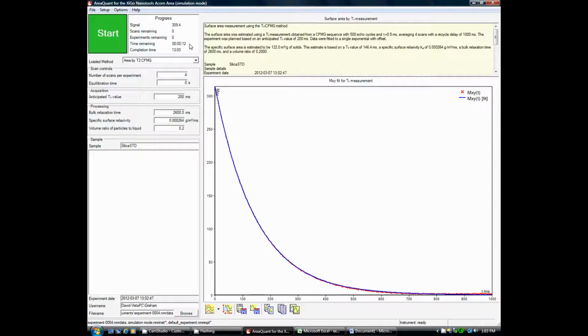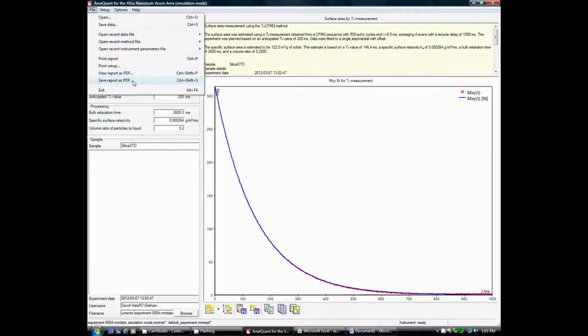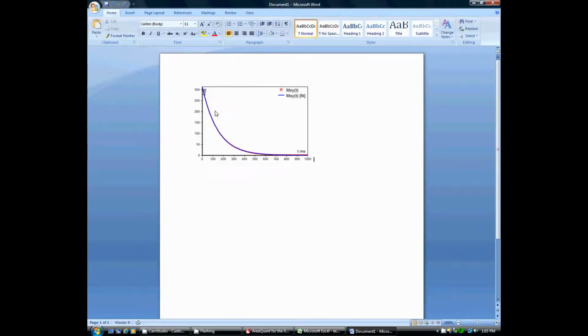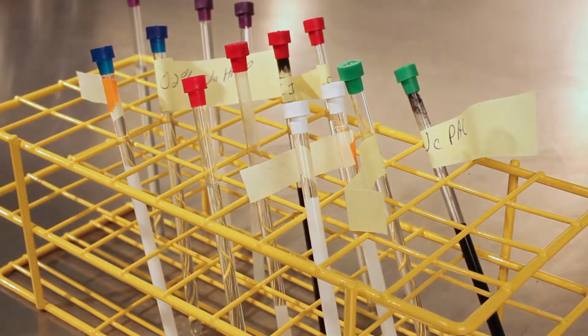The data files are in XML spreadsheet format and can be opened directly in spreadsheet applications like Microsoft Excel and OpenOffice Calc without modification. The test results can also be saved as a PDF. Graphical test results can be copied to the clipboard or saved as a JPEG file. At the conclusion of the measurement, the data can be repeated or the sample can be discarded and a fresh sample measured. The measurement is non-invasive, so samples can be stored and remeasured at any future time.